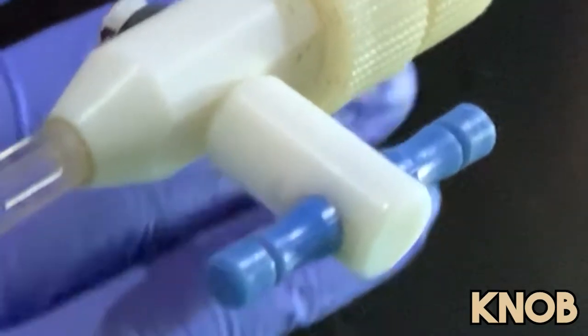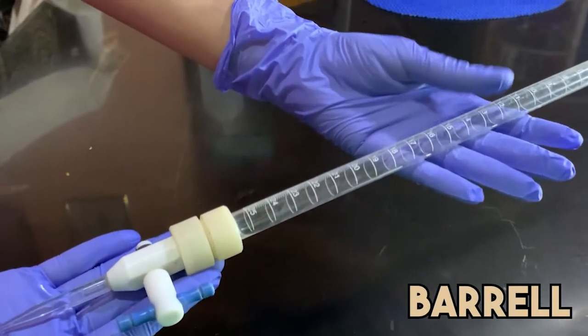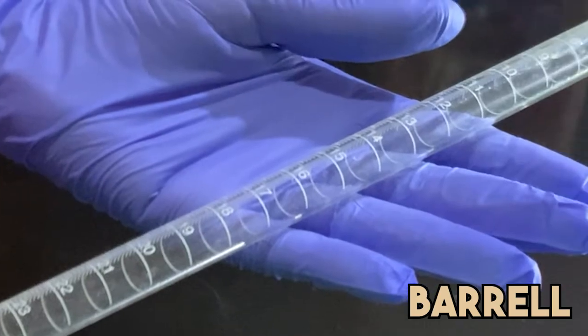Here, you can see a knob that seals the liquid from flowing out. Next, as you can see above the stopcock is the barrel, which is marked with accurate graduations in milliliters.